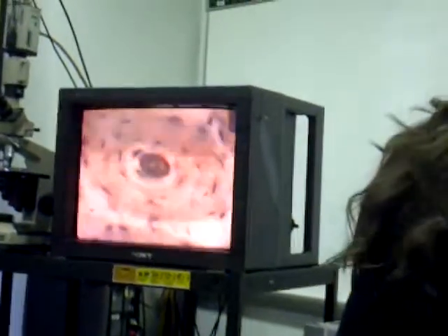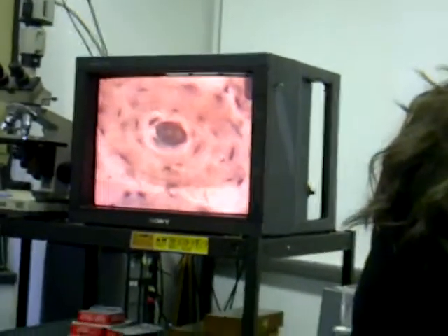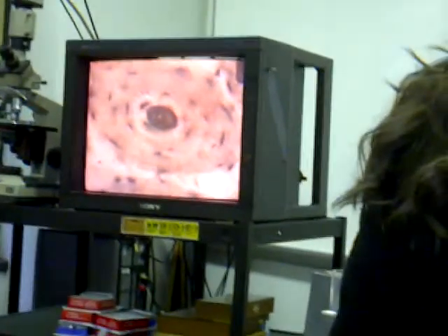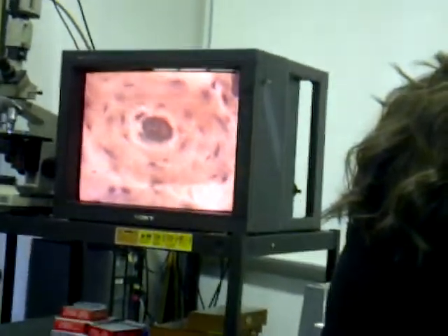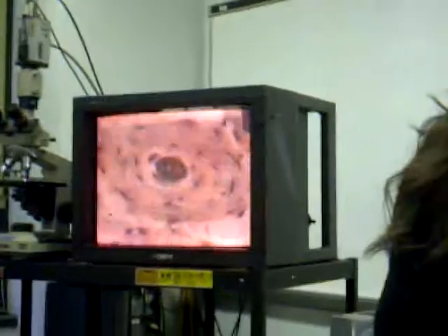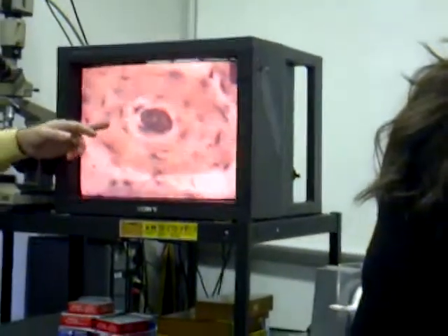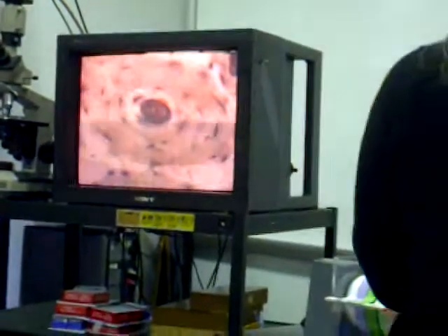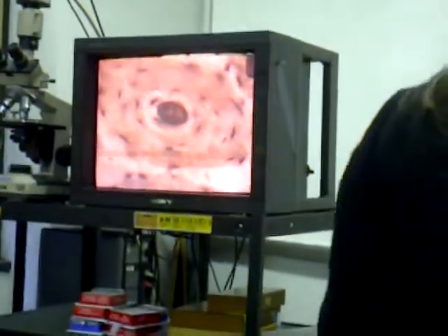The tissue type is not ground. Flying saucer. The ground part has to do with how this slide is made because it's bone. It's too hard to slice, so you have to saw a rather thick slice of it and then grind it down. And the bone powder fills the hollow places, and that's why they look black, because they're much denser. So you know that they're full of bone powder.